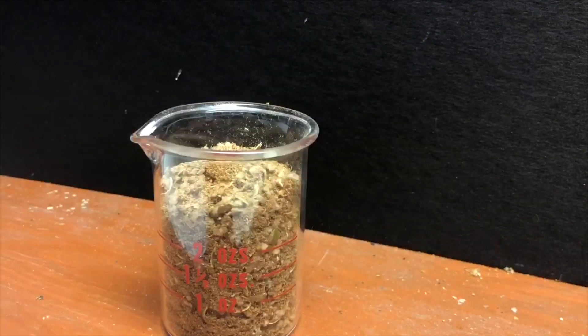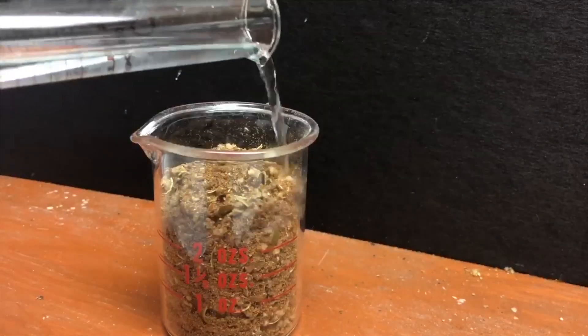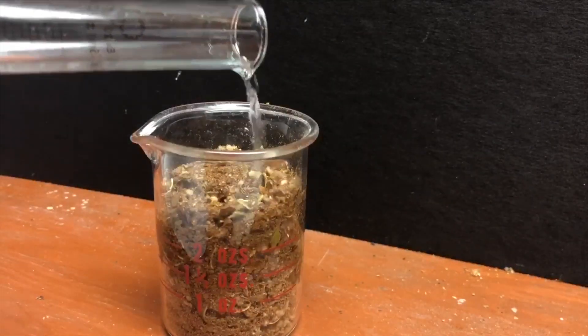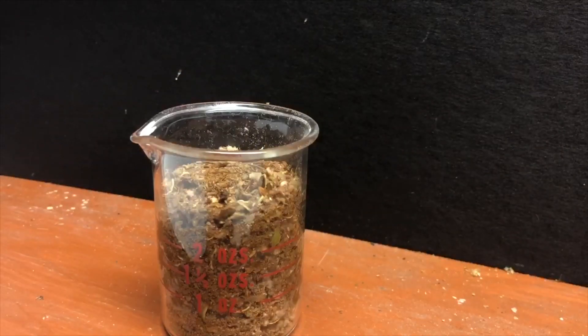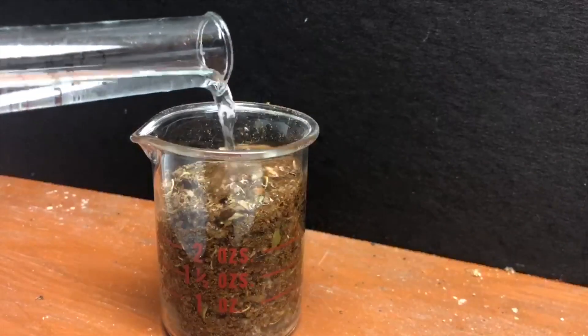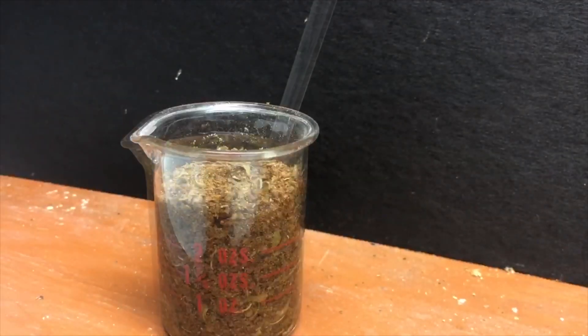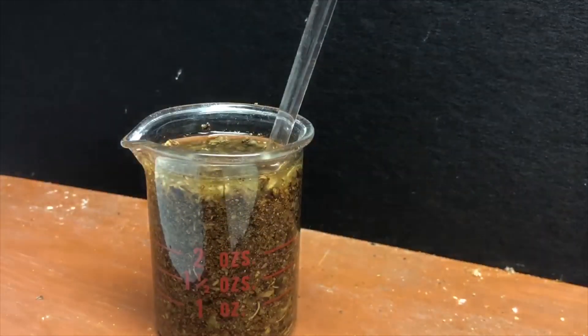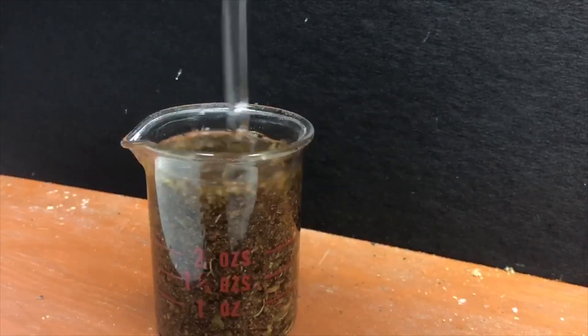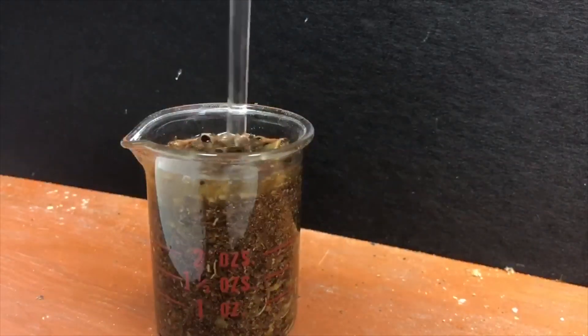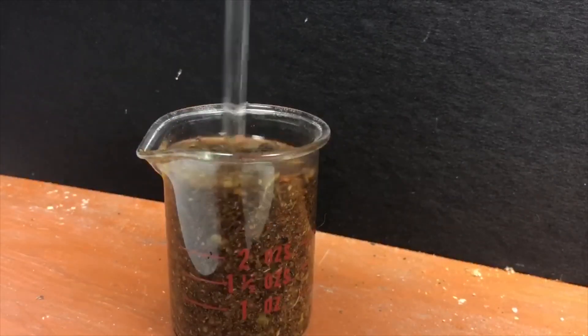Ideally, before doing the methanol extraction, you should probably do a defatting process. This is to remove all the lipids from the organic material. How you do this is add a non-polar solvent into a beaker, similar to adding the methanol. You would let the lipids get extracted and carry you away with a solvent, then you would filter it, keep the residue, and then you would do your methanol extraction on that. That should leave you with just the tannins and no fats.